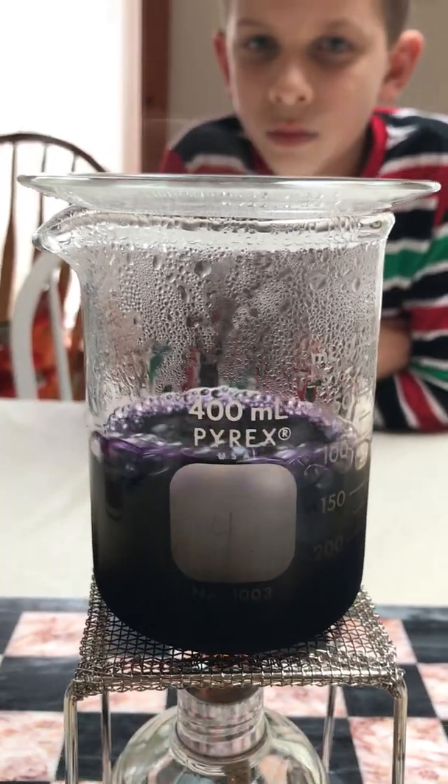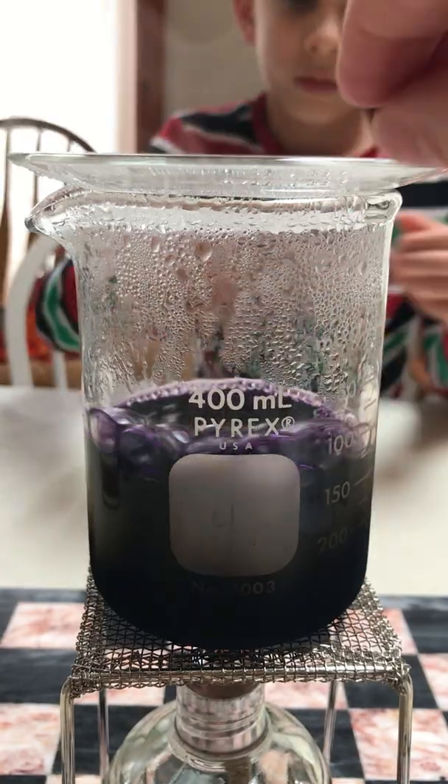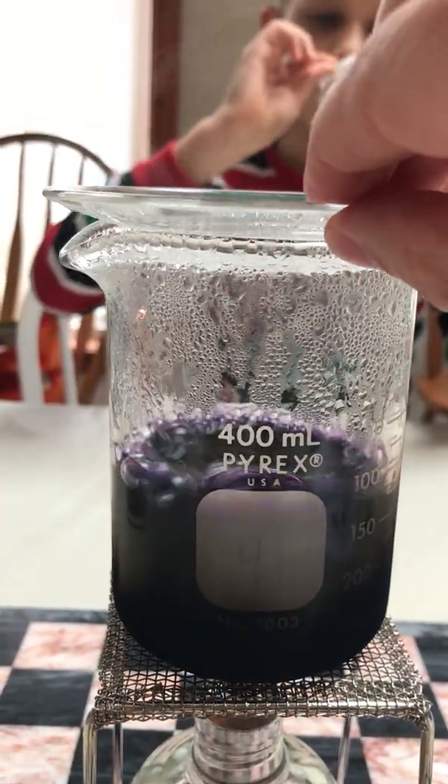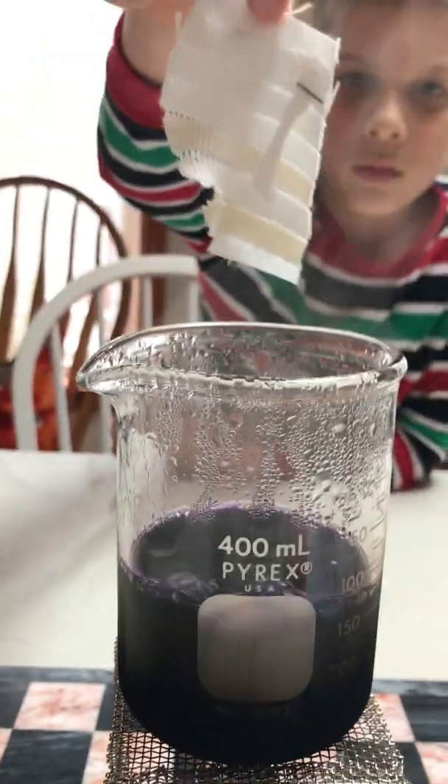What we're going to do is we are going to place — James is actually going to place — our unknown, which is stapled to our multi-fiber fabric, into the dye. So just drop right in there, James.